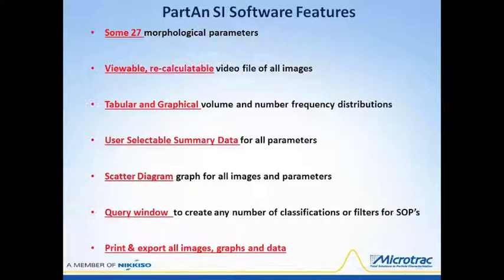The PartAn SI reports 27 morphological parameters. We'll take a close look at them later. The video files of each measurement are saved for later viewing and refined method development, and they can be remeasured under different settings and conditions or SOPs, standard operating procedures.